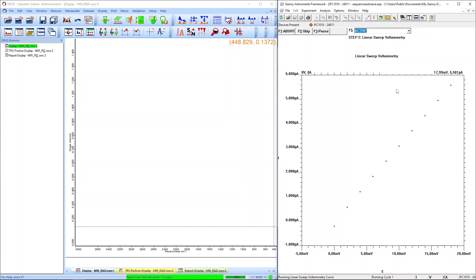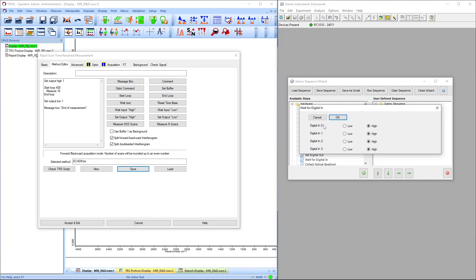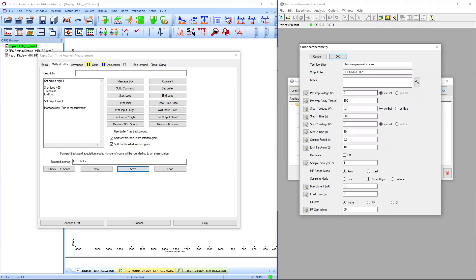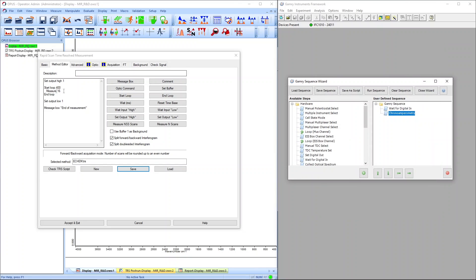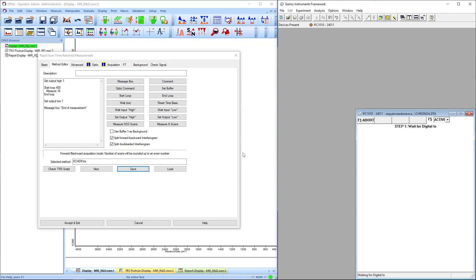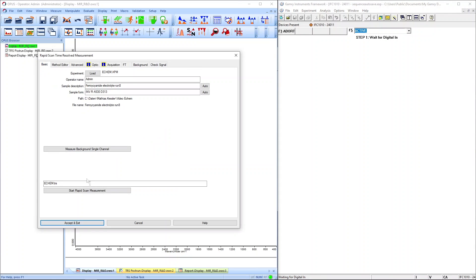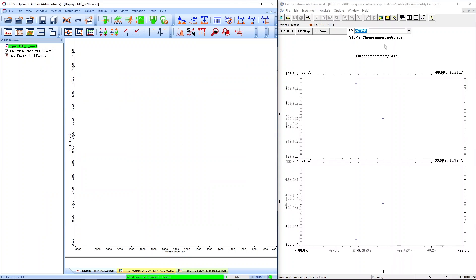The other way around is also possible. A wait command is applied in the GAMRI sequence wizard before a chronoamperometry run, in which the potential is stepped from 0 to 0.8 V after a waiting time of 100 seconds. A trigger signal is sent from OPUS, followed by the FTIR measurement loop with 400 spectra. As soon as the GAMRI sequence is started, the potentiostat waits for the trigger signal coming from the FTIR spectrometer, and finally both systems start the data acquisition simultaneously. You can see how the FTIR acquisition and the chronoamperometry run are running in parallel.